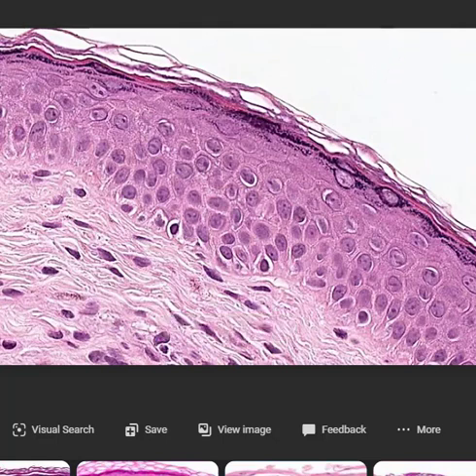When you look at cells under the microscope, you will notice that you don't just have one cell type. So in this one, we have several of our cell types we're going to be studying today. We're going to be studying the squamous, we're going to be doing cuboidals, and then we're going to get into connective tissue. So here's some of the connective tissue that we'll be looking at a little bit later. So on one slide, you can find different cell types that we're going to be learning today.